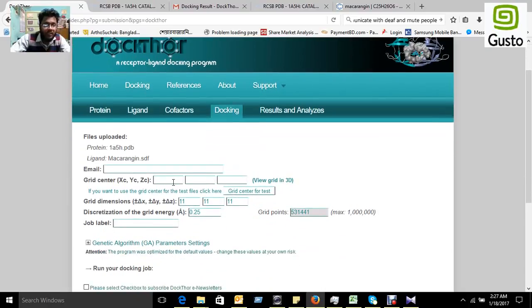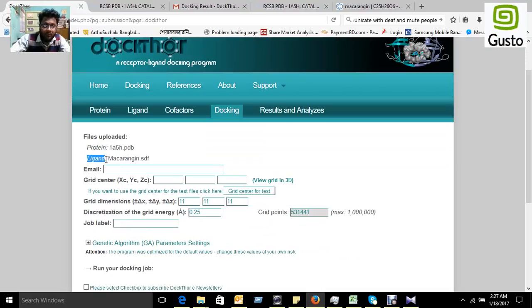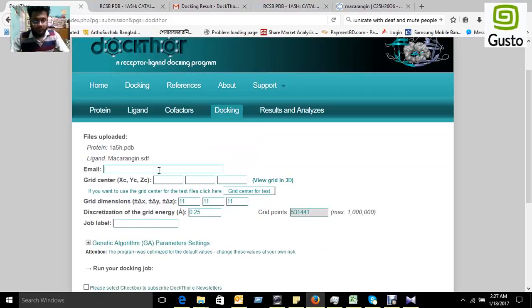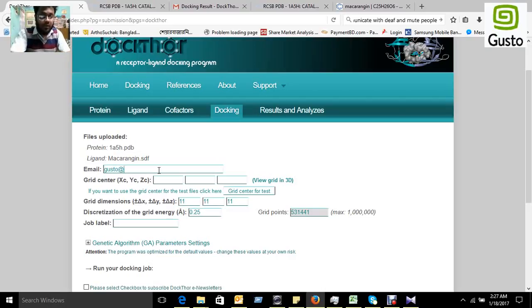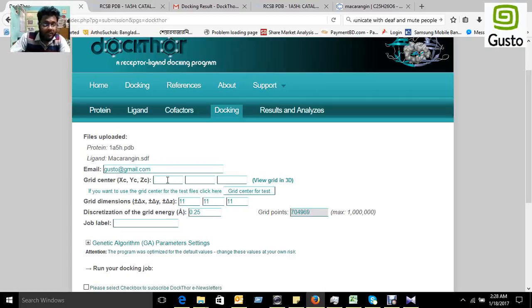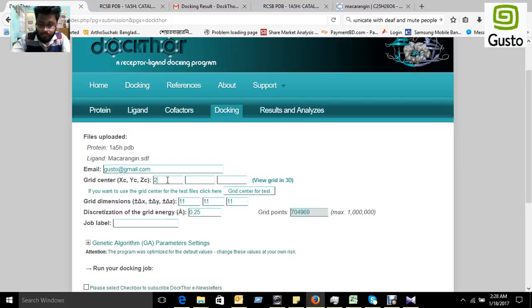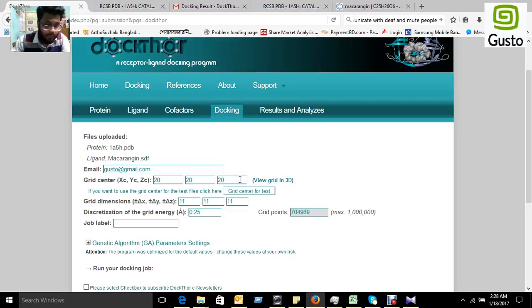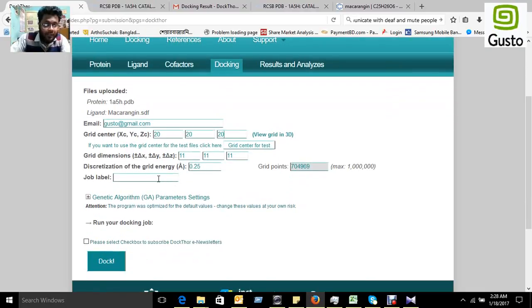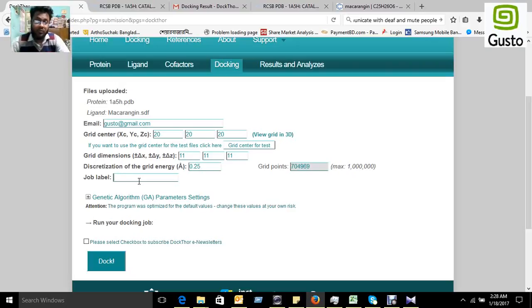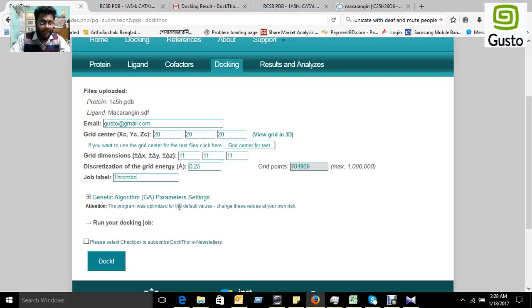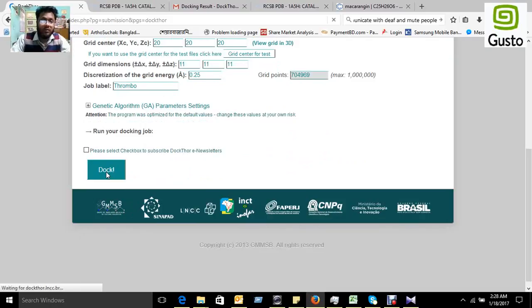Here will show what you added in protein and in ligand. You can type your email like something gusto at gmail.com. You can select the grid center, we can select 20, 20, 20. You can select it and you can give a job label. Because tissue plasminogen activator is working for a thrombotic effect, you can name it like thrombo. And finally, you just press the dock.